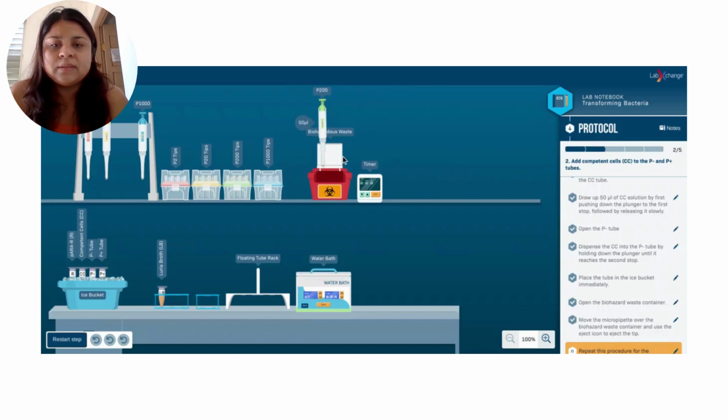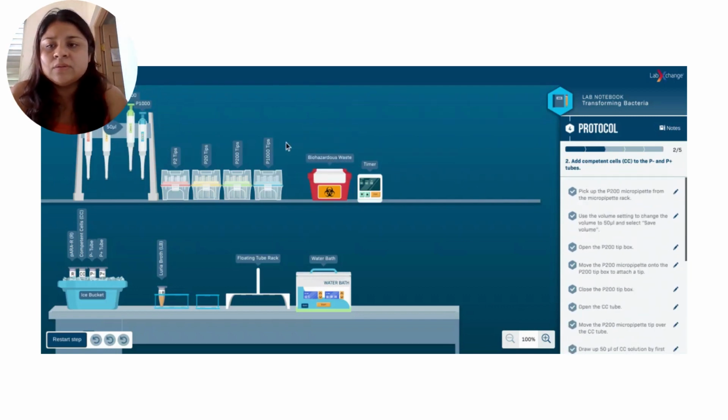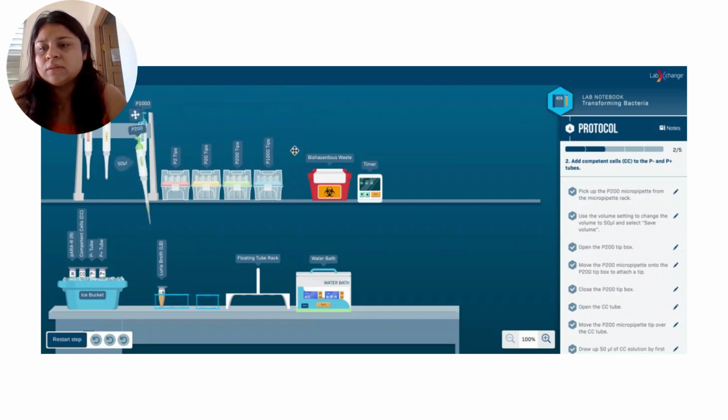Now you repeat the same process again for the P plus tube. Open this. Close it. Open the CC.